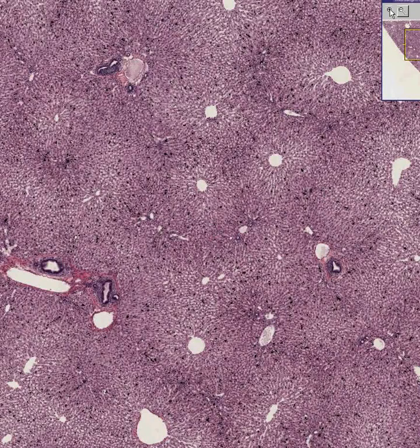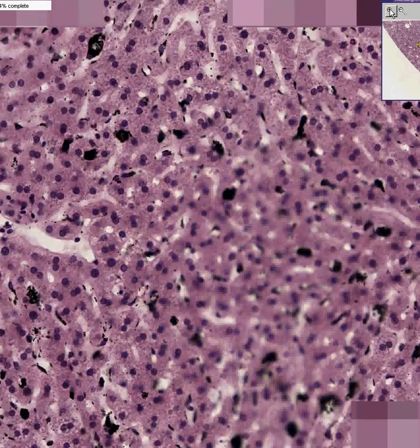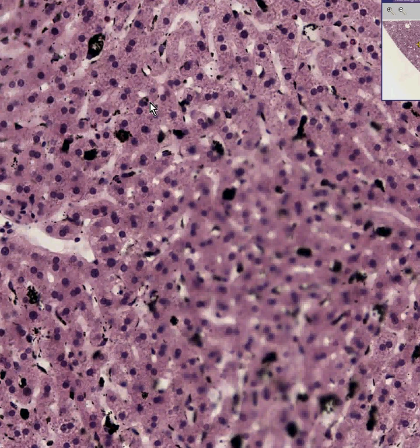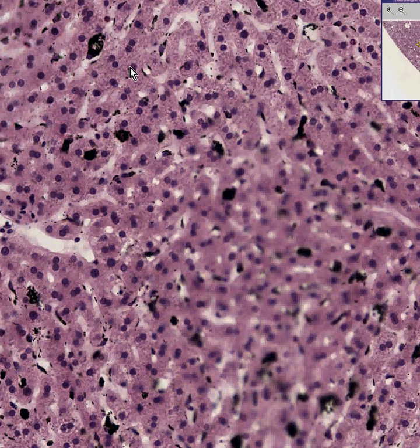This will be an extremely quick slide to show you how to differentiate Kupffer cells from hepatocytes. In the H&E, you are told that the hepatocytes are all these cells with perfectly round nuclei, and the Kupffer cells were more spindly.